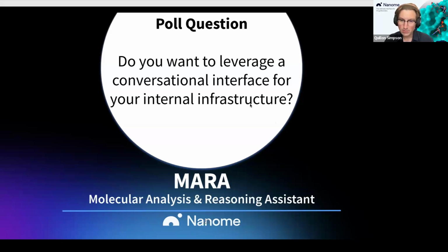One more question that just came in is whether we'll be working with universities to provide access. Absolutely. If you are a university academic and you have an interest in deploying Mara in your organization, either in research or as a teaching tool, by all means, please reach out to our sales team. We're really interested in understanding how you'd like to deploy it and how we can help you improve the research and educating you'll be doing.